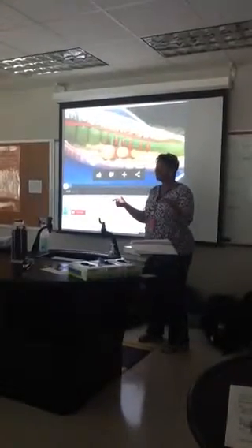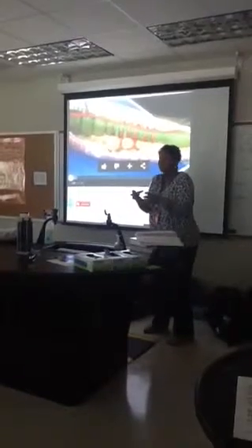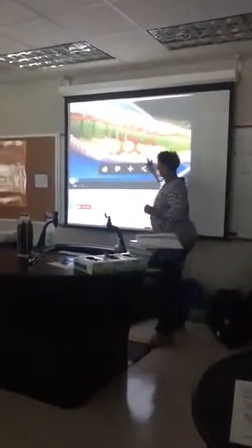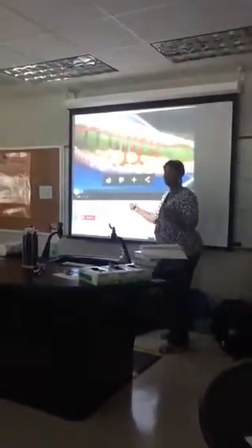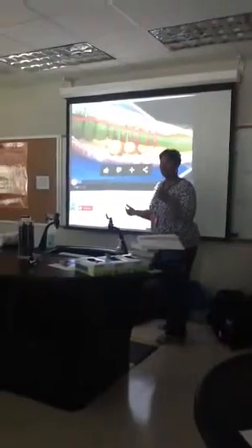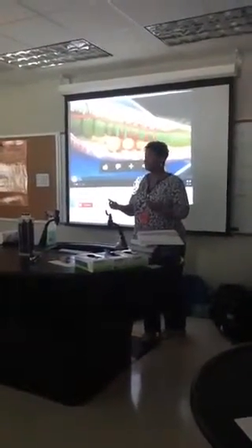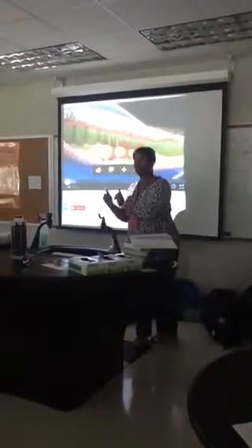You've done a great job today as far as dissecting, but some of you are a little bit timid. What I want you to do when you come in on Tuesday, by using YouTube and looking at the different dissections, is to be a little bit more comfortable when you do the rats. Why? Because the rat will be a little bit more what? Challenging as well as difficult, because we will be doing a vertebrate, okay?